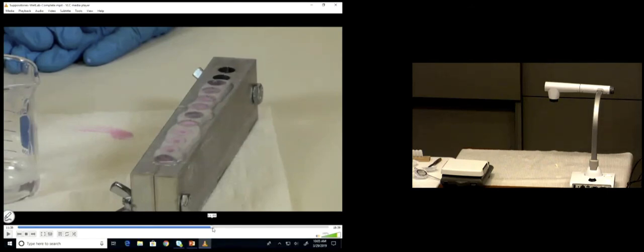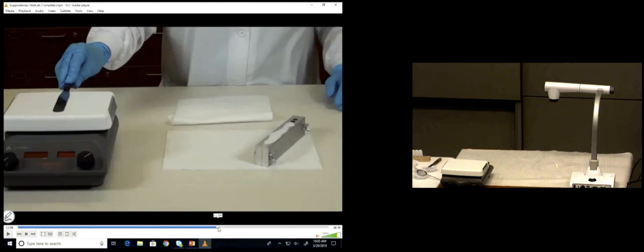And then you have to wait 20 minutes, okay? And you can see what it'll look like 20 minutes later, all right? So that's when it'll be ready to go. We're ready to trim it. Should there be any blue on top? Do you see where it's all white there? Why? In this case, I know we did pink there, because all the pink, all the drug is down below, and we overfilled with the excess. That's what it should look like, all right?